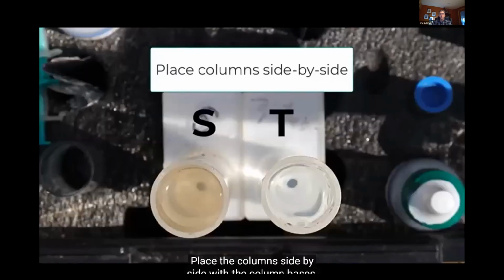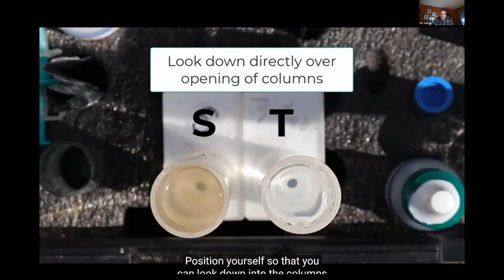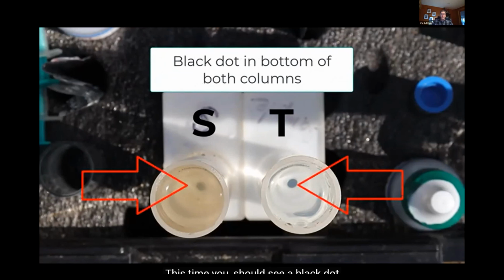Place the columns side by side with the column bases almost touching. Make sure that they are on a level surface, like in the center of your kit. Position yourself so that you can look down into the columns through the openings, preferably from a distance of about 6 inches. This time, you should see a black dot on the bottom of both columns.